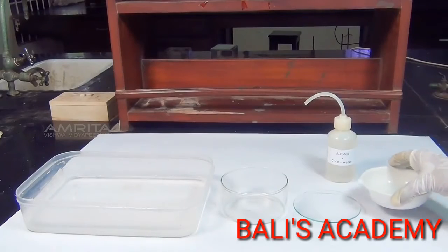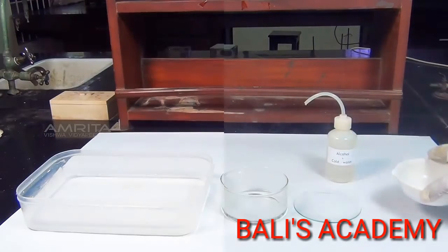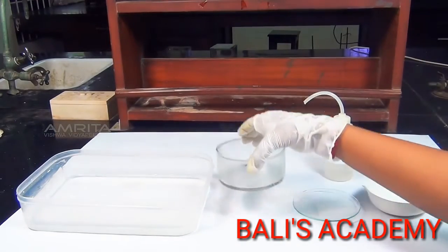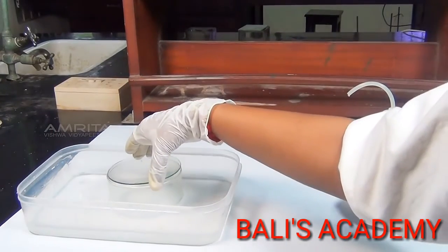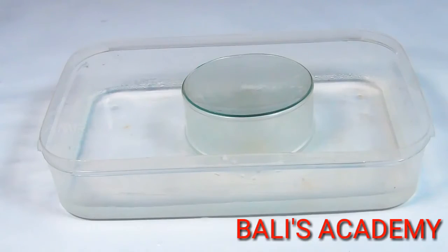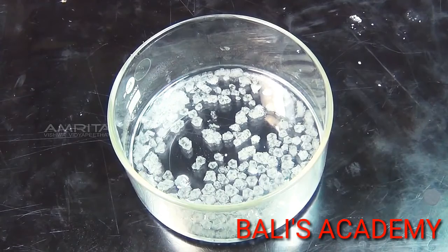Now transfer the hot saturated solution into the crystallizing dish. Place the crystallizing dish in a trough containing cold water. Cover the dish with the watch glass and allow it to cool slowly for some time. On cooling, colourless crystals of potash alum separate out.